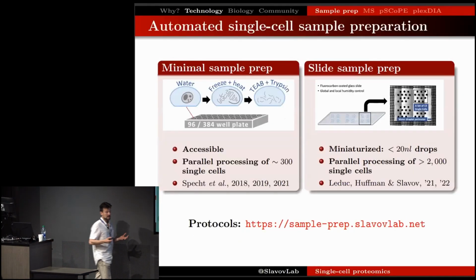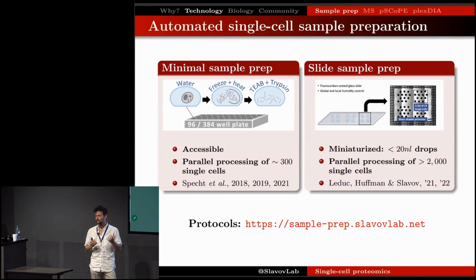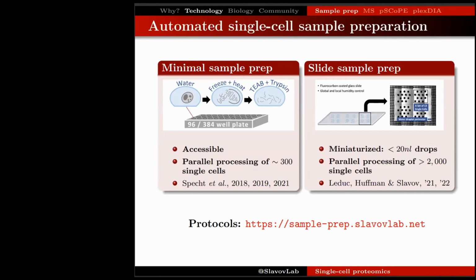To begin with, of course, we have to be concerned about sample preparation of very small cells. How do we prepare tiny cells without losing their proteins? Keeping proteins in, keeping contaminants out, that's clearly a challenge. And my group has worked on a number of different approaches for that, different generations. Here, I share two methods that we have selected because of their advantages.